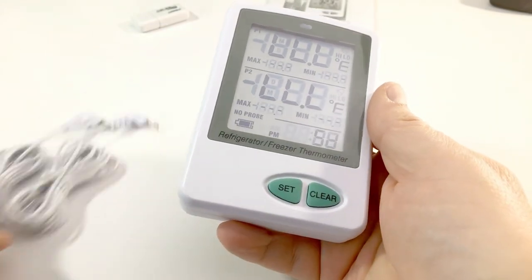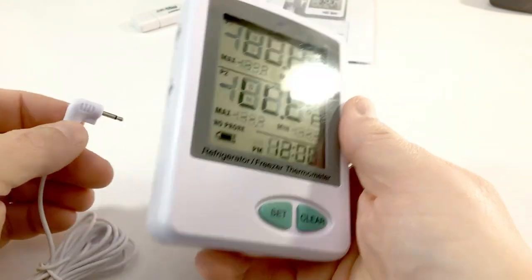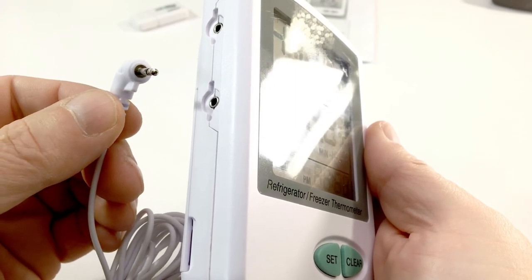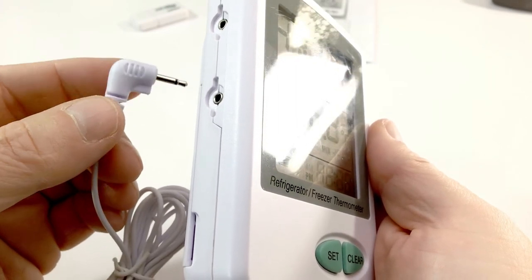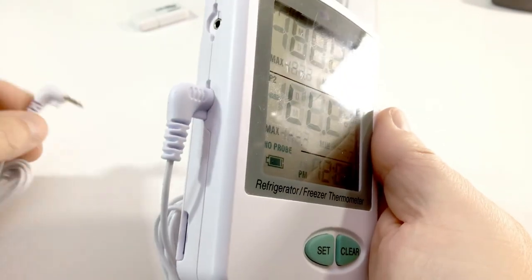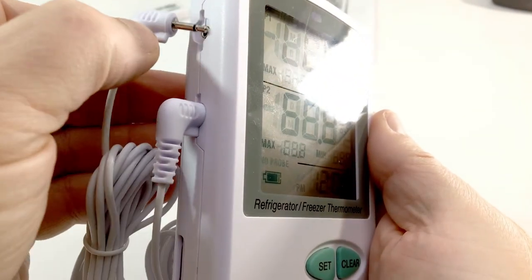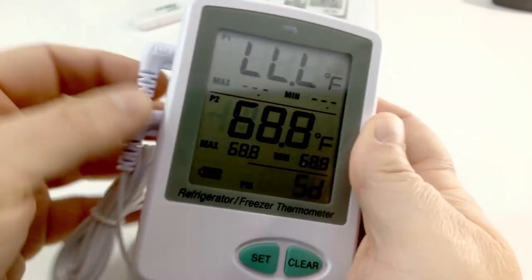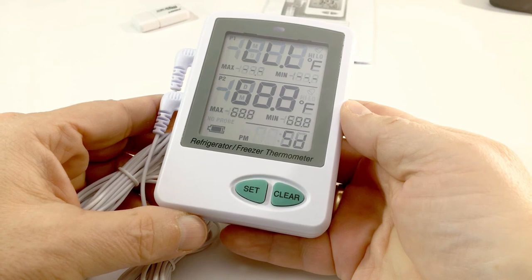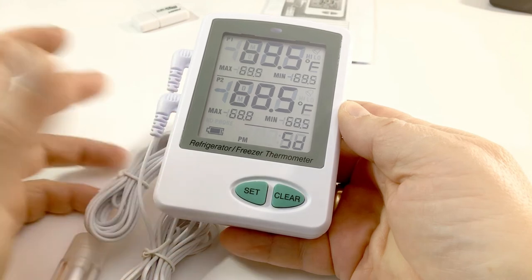Now install the probes. They are keyed — there is a little tab on the jack and on the probe, so they can only face downward or totally upward. Once inserted correctly, we are set to go.